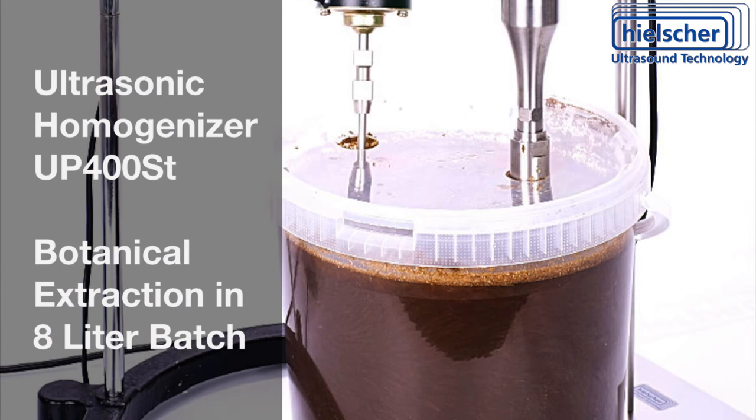Using this setup, you could also disperse powders, dissolve materials, or emulsify liquids.